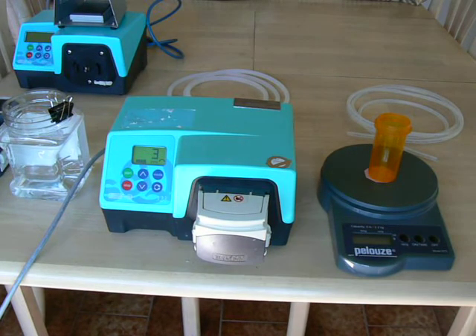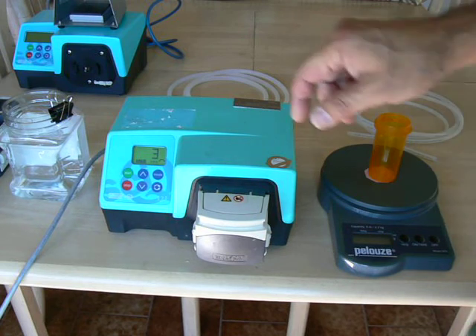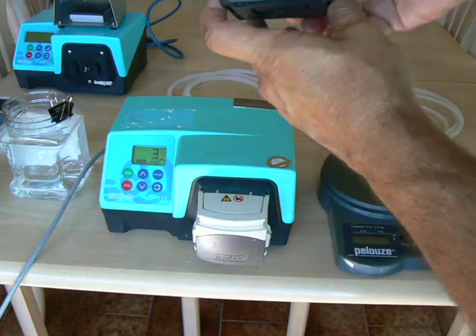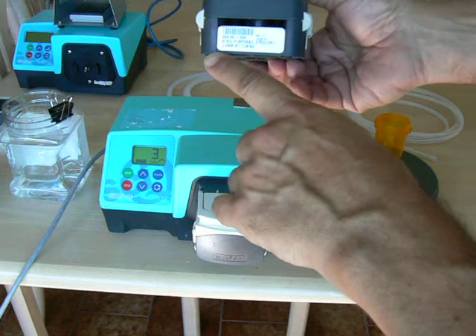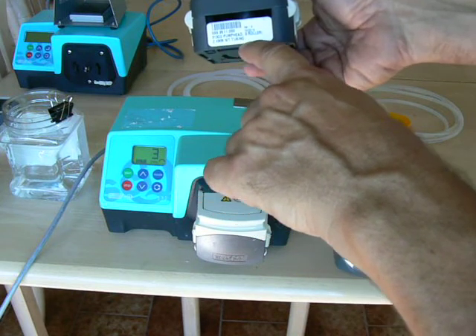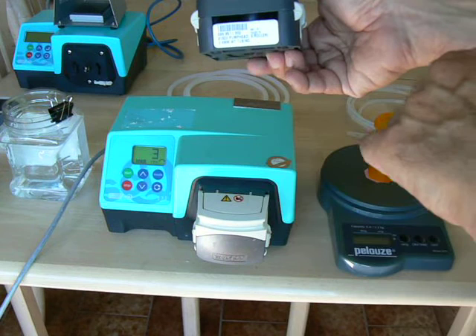The 323 pump, like most of Watson-Marlow's pumps, is designed around a specific wall thickness of tubing. The 323 can come with a pump head that accepts either 1.6mm wall thickness tubing or 2.4mm wall thickness tubing. The way you know which you have is you look at your pump head — on the label on the very bottom, it'll actually say which wall thickness of tubing it's specified for.